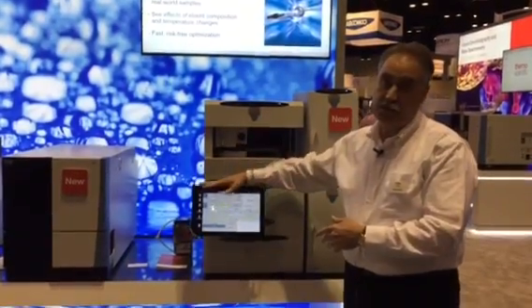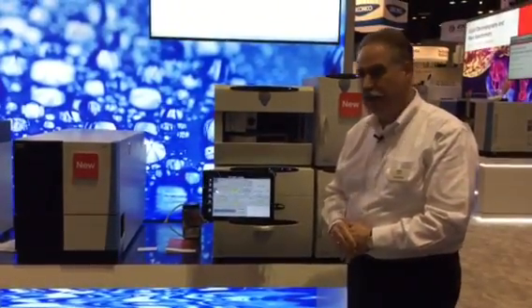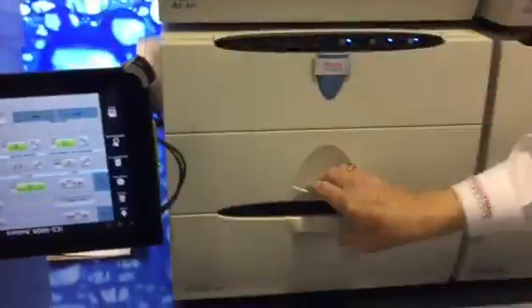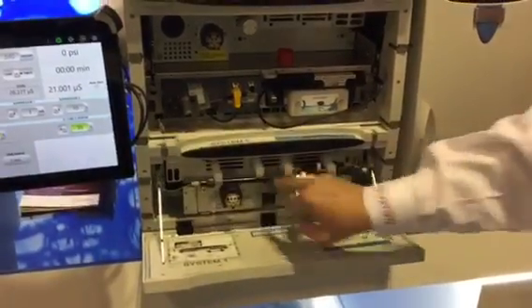The main customer-facing feature is the front panel that we've incorporated in a tablet format. This gives us direct control of the system, and we've also included other features including the ability to have consumables monitoring in the system with RFID and one-wire technology.